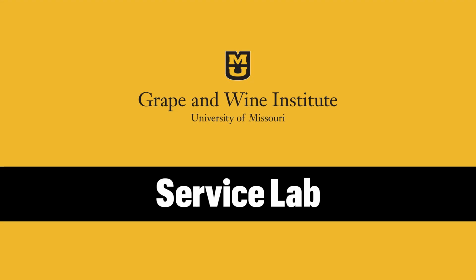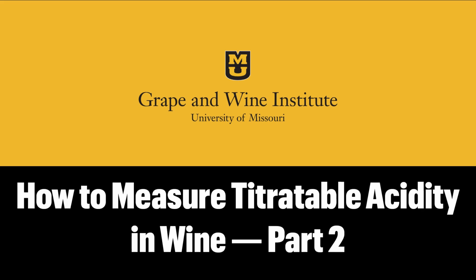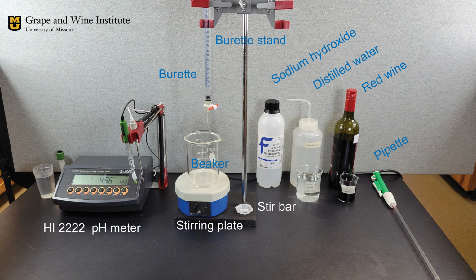In this tutorial, we will demonstrate how to measure titratable acidity using a pH meter. The material we used: a burette and a burette stand, standardized sodium hydroxide solution, 0.1 molar, distilled water, wine sample, a 10 milliliters volumetric pipette, calibrated pH meter, a beaker, a stirring plate with a stir bar.